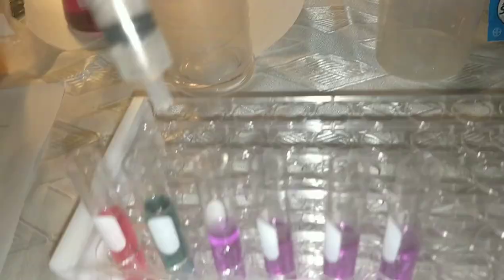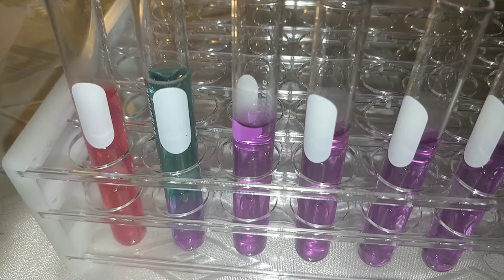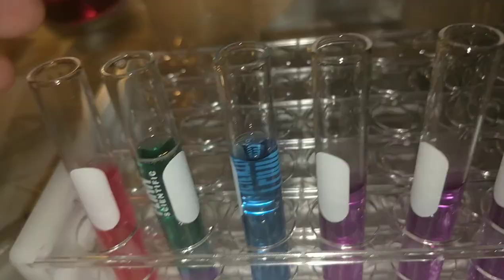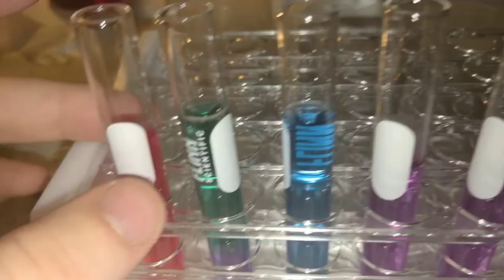Next we'll test the baking soda — this is the antacid, and this is the baking soda solution. One milliliter into the next test tube. You can definitely see the difference between this one being green and the antacid being a blue, so I'll record that.